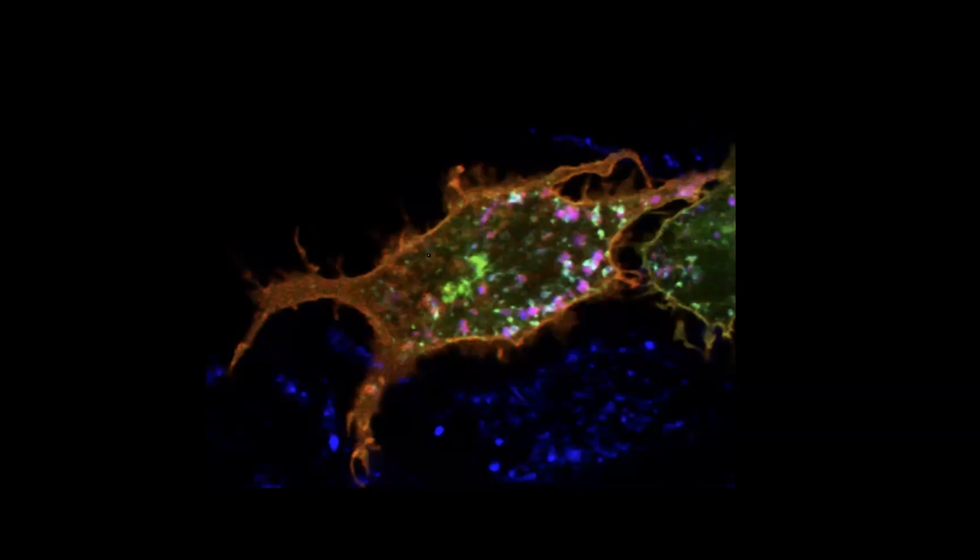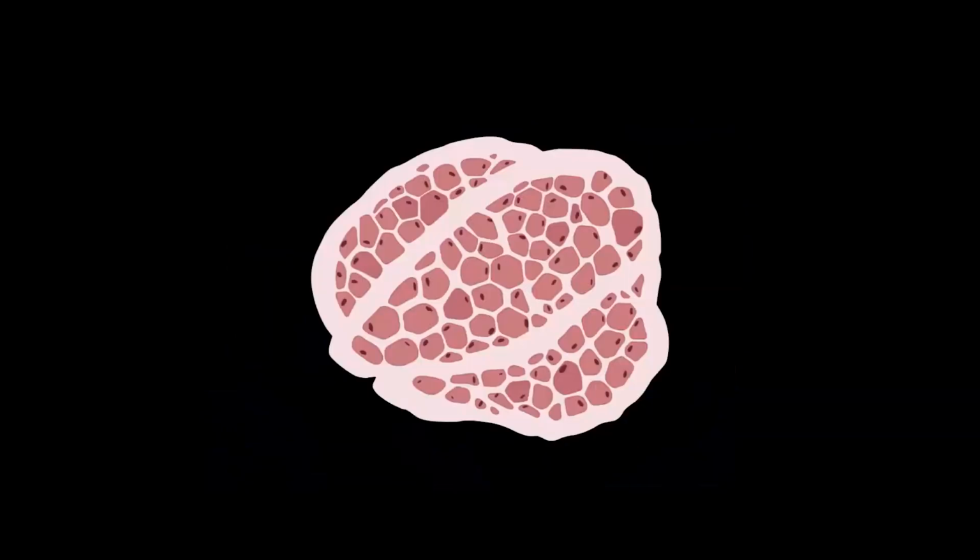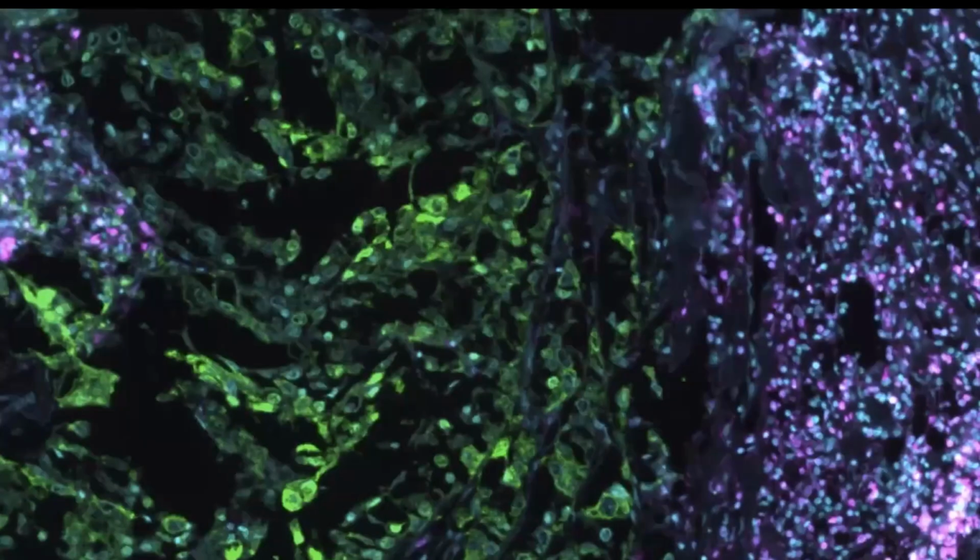extract from these images. And it becomes even more complicated when we start to work in tissue, especially three-dimensional tissue, because again, this idea of neatly partitioned cells just doesn't stand up. You look at the tissue and things are very complex, overlapping, intermingled, and using standard approaches to biomedical image segmentation will just leave you very frustrated.